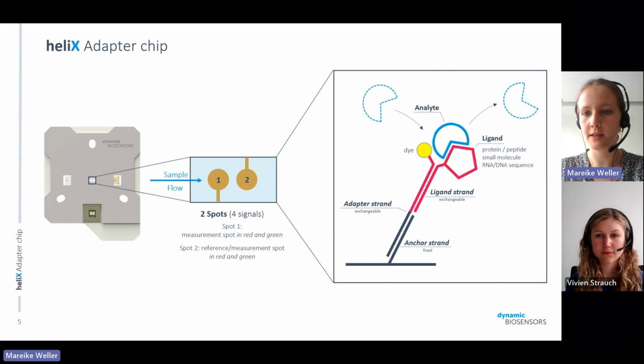Again, to our surface. As I already told you, we have the fluorescent dye here and the ligand strand, and the analyte that can be injected and ejected. So the setup is very flexible, and I will also show you soon how we use this for the aptamers.